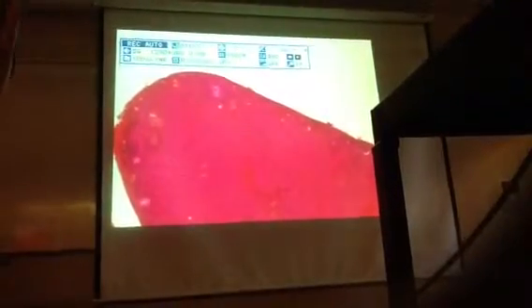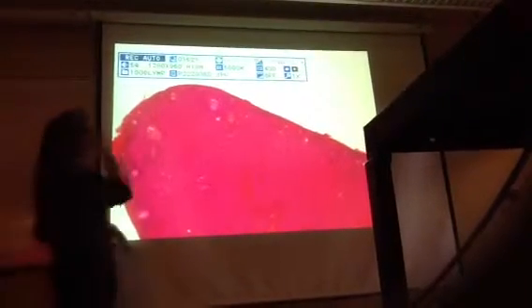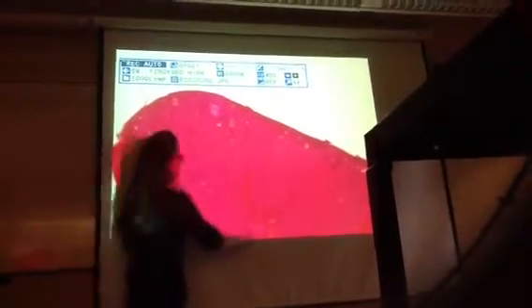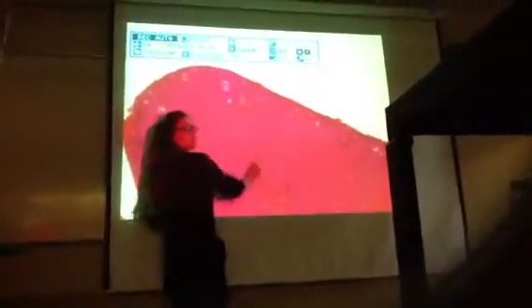Is there blood supply? There's blood supply into the ovary, yes. Lots of blood coming into the ovary. You can't see the veins on here just because of how it's sectioned. Well, these right here might be blood vessels that you're seeing in cross section. That would probably be right there.